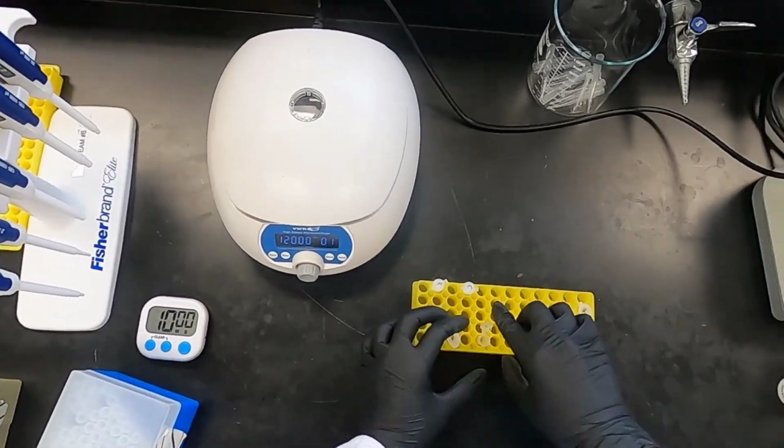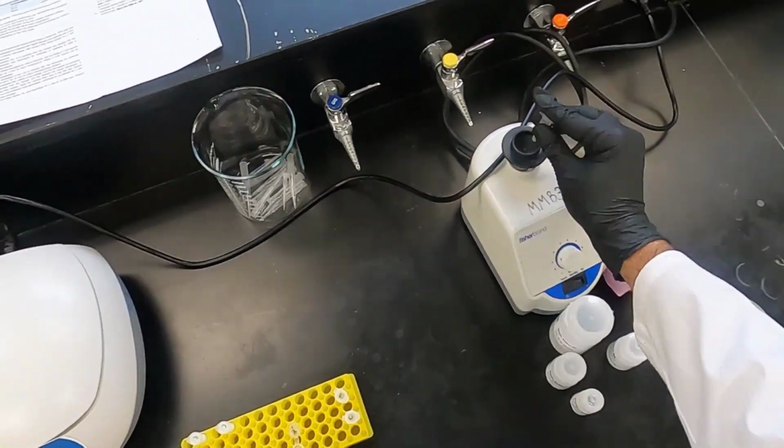As always, we're going to vortex between steps to make sure everything is homogenized.